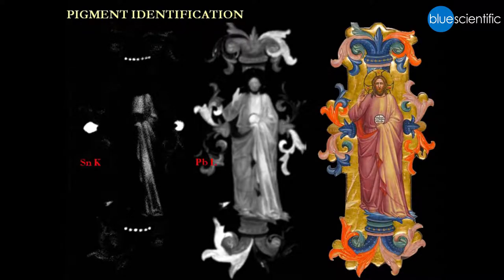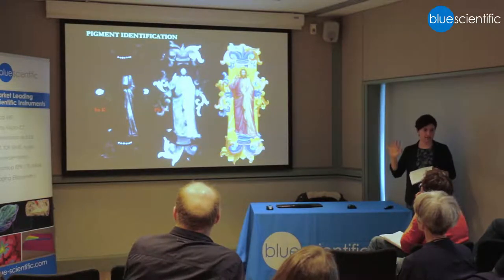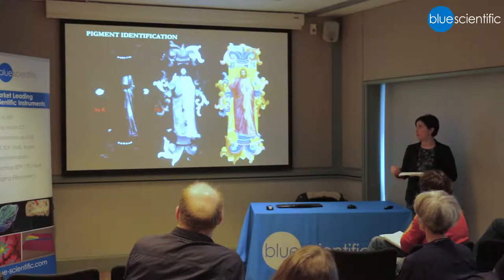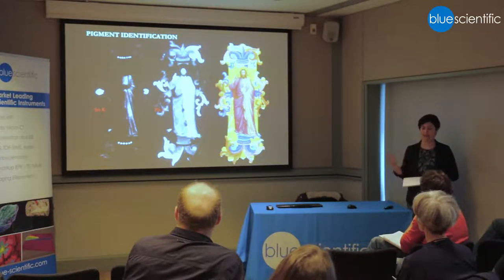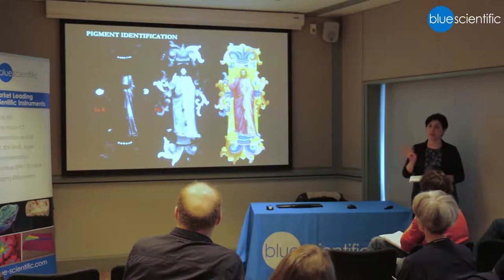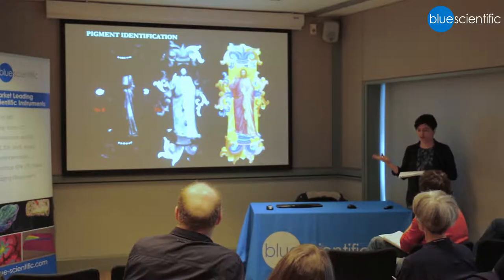In this case, I've put up two maps — one for tin and one for lead. Historically speaking, there are a total of four pigments in which I can find these two elements: mosaic gold, which is tin sulfide; red lead, which is lead tetroxide; lead white, which is lead carbonate; and lead tin yellow. These are the four pigments I'm looking for when examining these two maps.